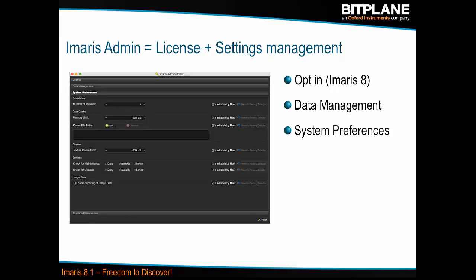And in addition to this, you have also the advanced preferences. If you've ever delved that far into Imaris, it includes something like 200 parameters to do with the settings of Imaris. You can go in there and change them all if you wish or not. But now you can control that as well.